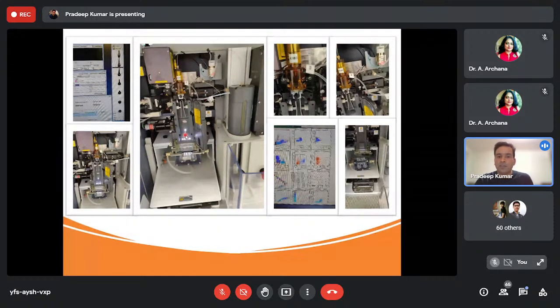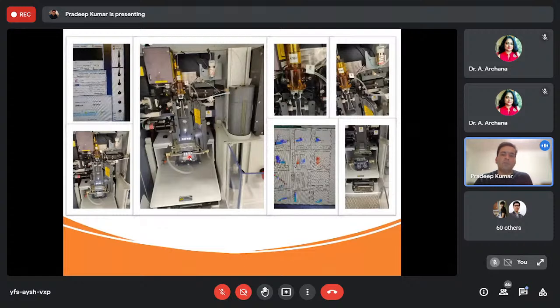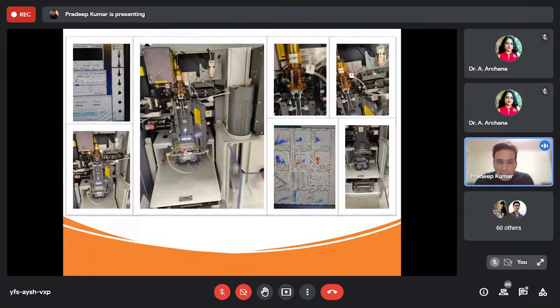The next slide is an image of how the continuous stream is going into droplets. You can see there are 4 Eppendorf tubes in there. What I was doing today was running a patient's whole blood sample, and in that sample we were looking for different populations, like basophils and dendritic cells. There were a lot of populations we were looking at, like T cells, B cells, basophils and monocytes. Of all those different populations, we were interested in just 4, and we wanted to segregate them into individual tubes.